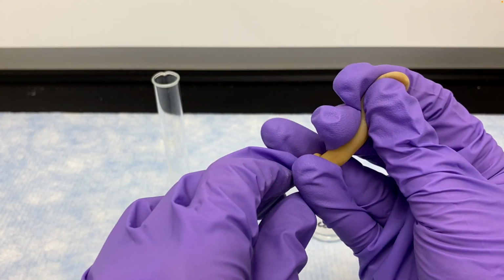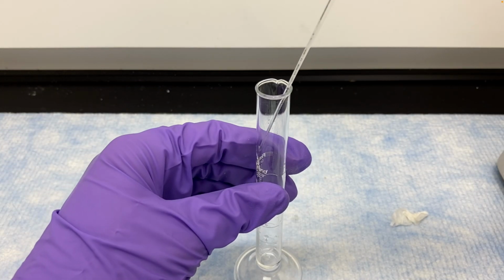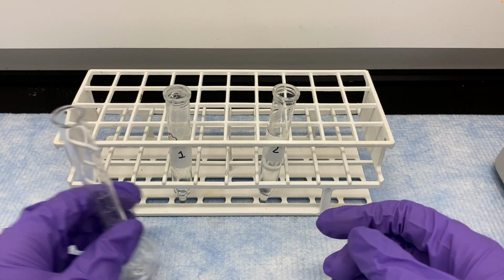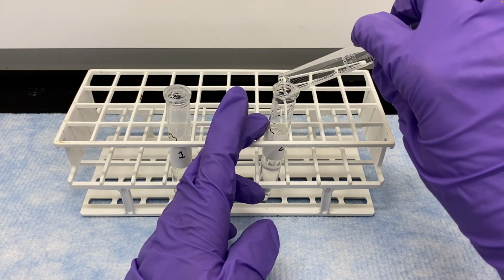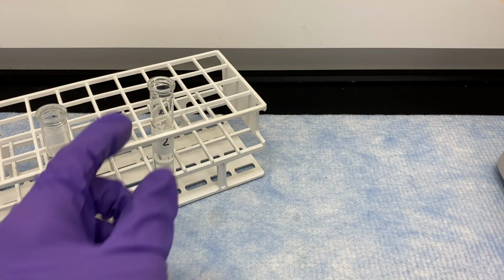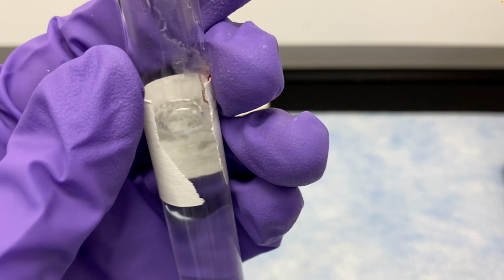So we're going to measure some ethyl acetate out. Notice that I'm squeezing that pipette bulb before I put it into the liquid so that when I put it in the liquid it doesn't splatter. And now we're going to pour that ethyl acetate into our water. Close it so we have our two layers. You can see that line here. Ethyl acetate on top, water on the bottom.